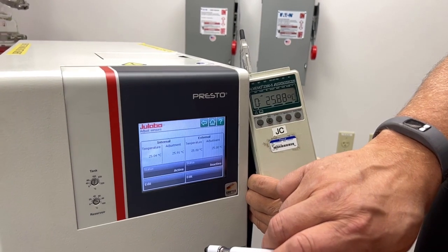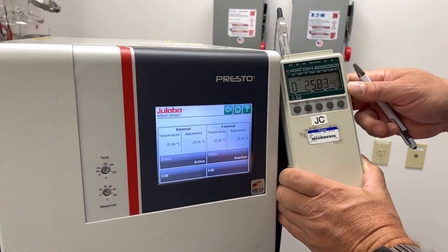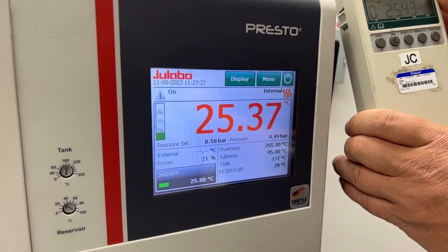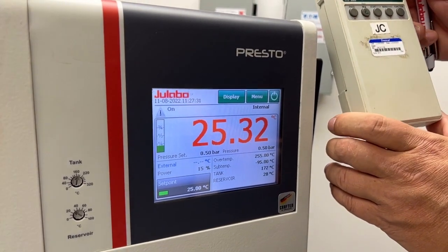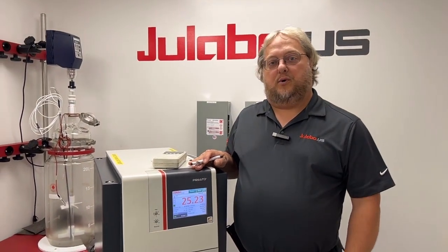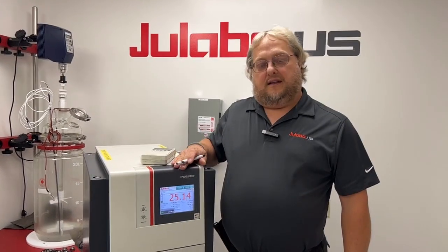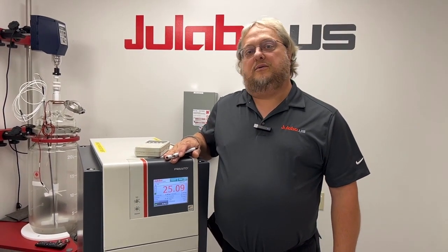Now if we want to make this the active temperature, you click the Active button and that will be used as the displayed temperature. If you wanted to do the two or three-point calibration, you would go through and perform the steps at the additional calibration points. And that's how you perform the ATC on your Presto unit.